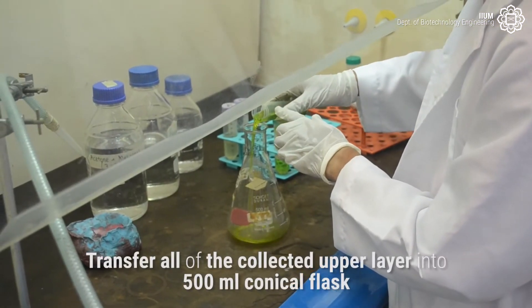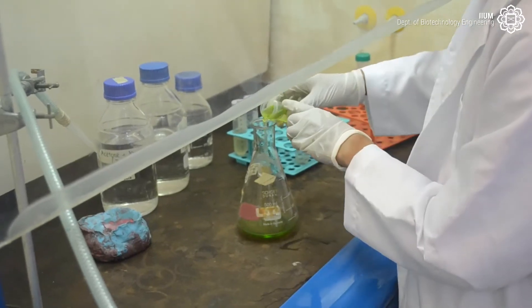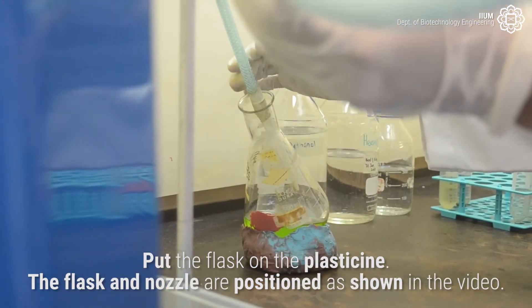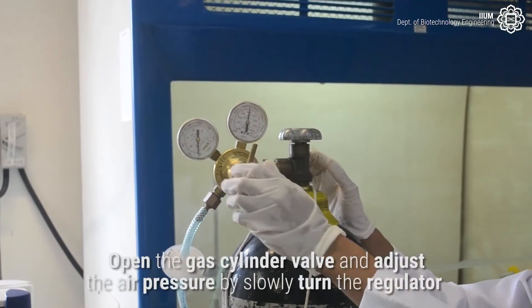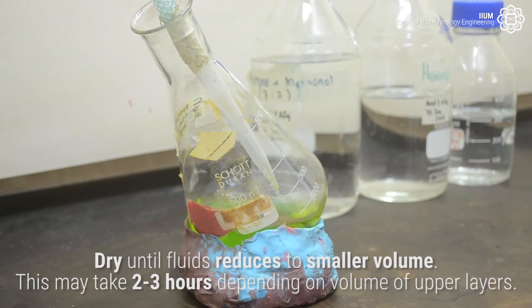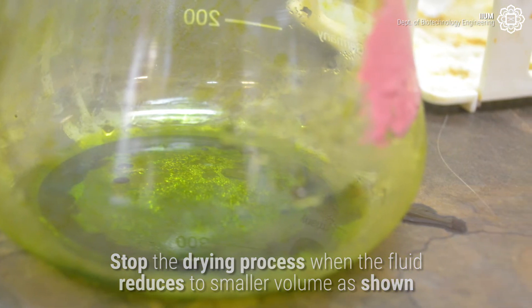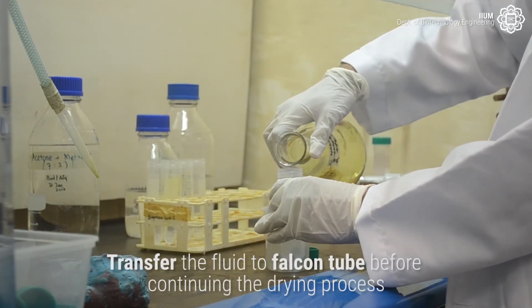Transfer all of the collected upper layer into a 500 ml conical flask. Place the flask on the apparatus, positioning the flask and nozzle as shown in the video. Open the gas cylinder valve and adjust the air pressure by slowly turning the regulator. Dry until the fluid reduces to a smaller volume; this may take two to three hours depending on the volume of the upper layers. Stop the drying process when the fluid has reduced to the smaller volume as shown.